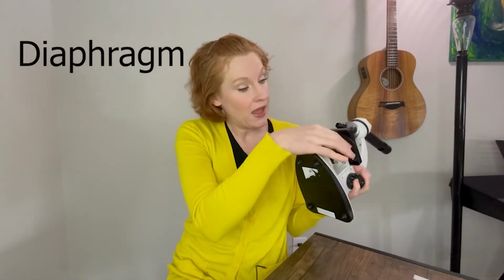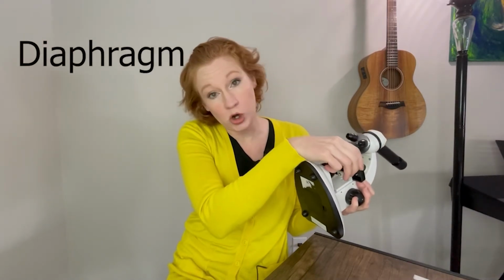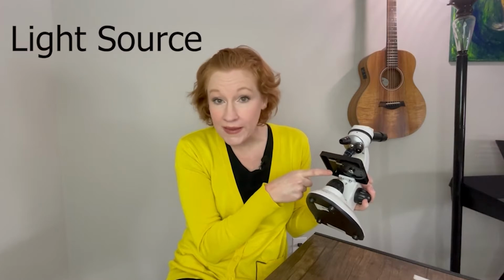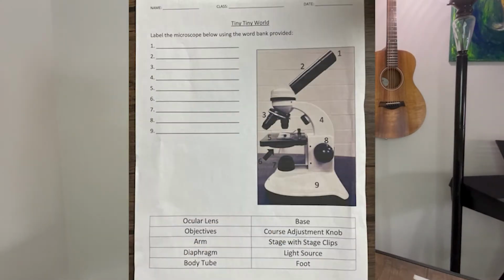Then underneath here, this is called the diaphragm, and you use this to let in more or less light depending on what you're looking at. Underneath here, this is your light source. That's where the light comes from. Go ahead and fill those things in on your worksheet, and when we come back, we are going to look at microorganisms underneath a microscope.